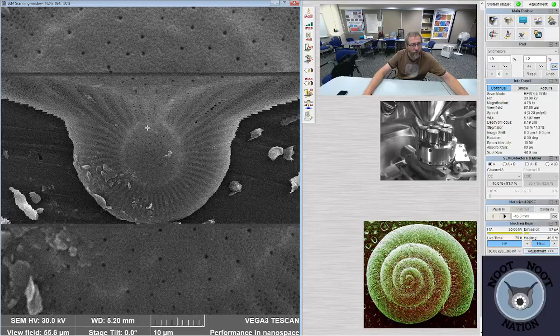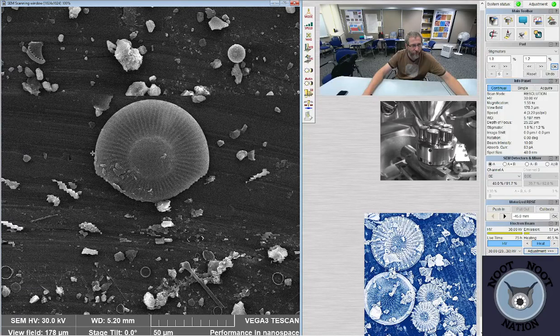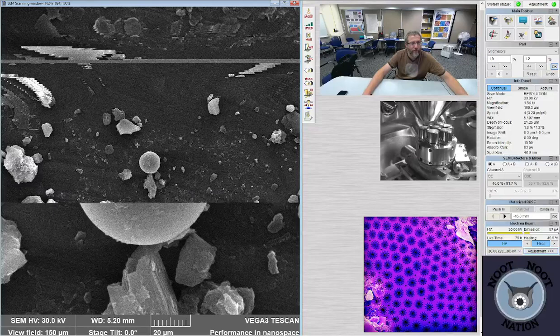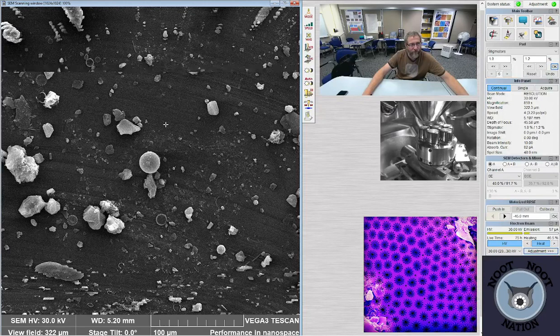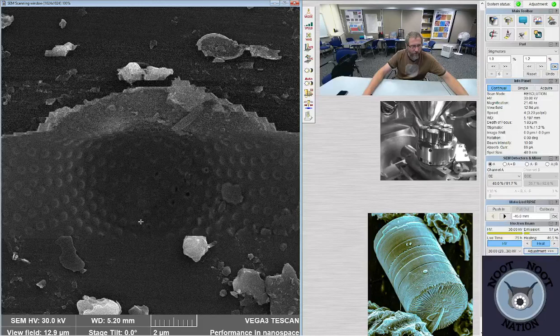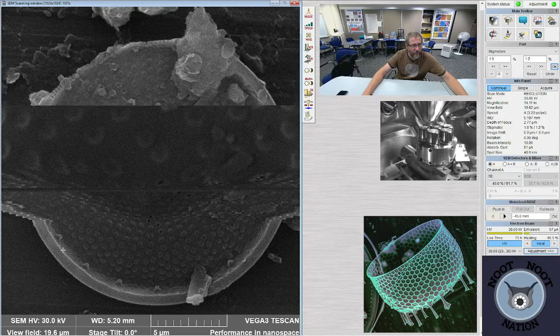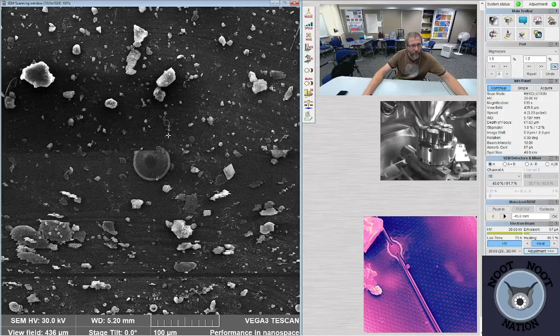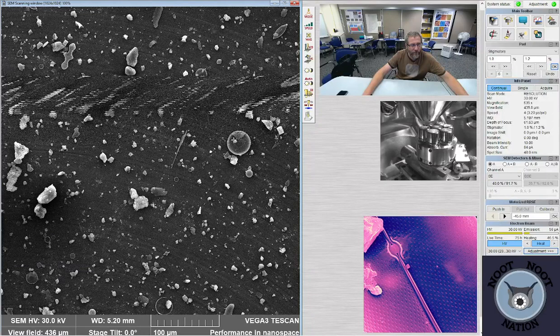Let's see what we can do about, let's find an internal view of one of these big guys. It's a chrysophyte. There's a bunch of really big chrysophyte cysts in here. And those are 15 micron. Pretty big, at least for what we usually see. This is just Stephanodiscus. It does not look like a Cyclostephanos to me. The same thing over here. Everything we have on here is just a plain Stephanodiscus.